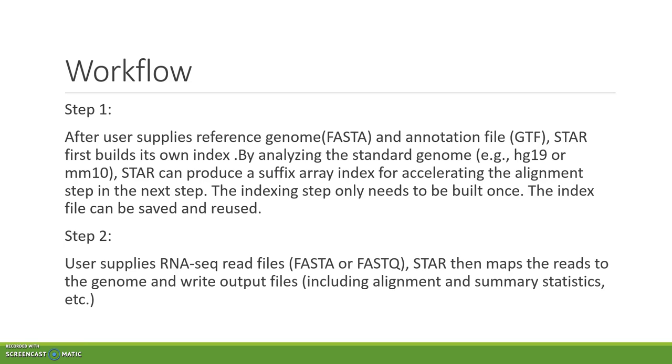Step 2, the user can supply RNA-seq read files. STAR will then map the reads to the genome and write output files, including alignment files and summary statistics.